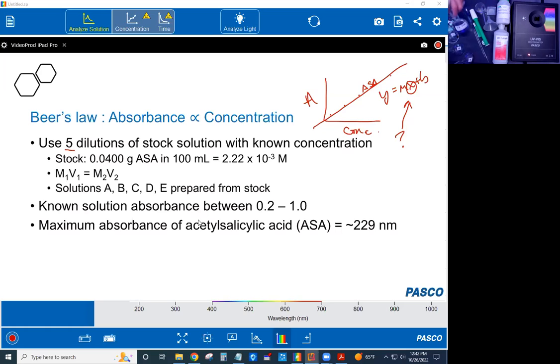And then you dissolve it in 91% isopropyl alcohol using a volumetric flask to make the stock solution. Now the concentration of that stock solution will be 2.2 times 10 to the negative 3 molar. It's very low concentration, but that's okay because this is the minimum concentration we need to get a nice 5 solution plot with this spectrometer.